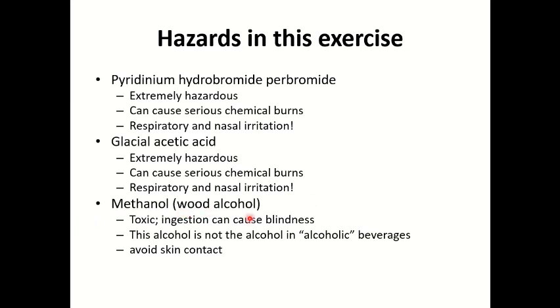And the methanol is the wood alcohol. Remember that it's very toxic, and ingestion can cause blindness, and can damage your neurological system as well, and you should avoid skin contact while using it.